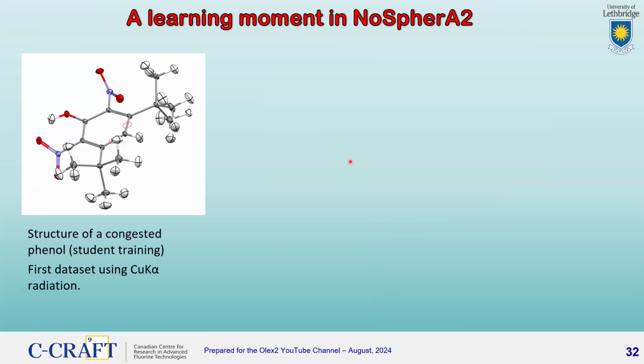It concerns two structures. First of all, this very congested phenol that the student was training on. So they were measuring the data, and I was doing it along with them, showing how it was done. And you can see it's a beautiful copper data set that could be refined by NoSpherA2, with accurate placement of all the hydrogens and the hydrogen bonding.